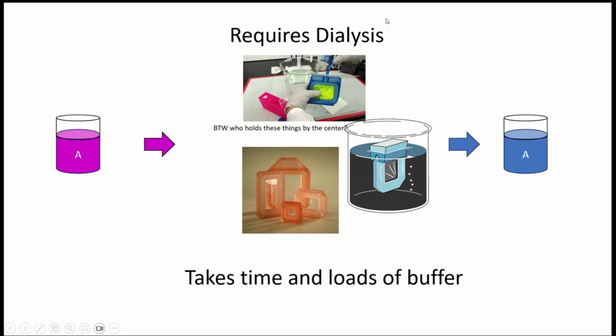This requires dialysis, right, which I did in order to set that up. I didn't really discuss it. I didn't discuss it at all, I don't think. And that dialysis takes time and loads of buffer.